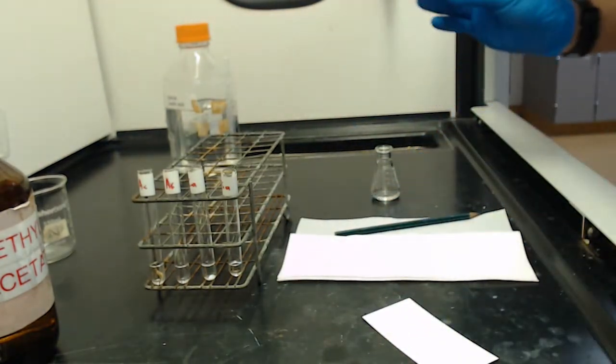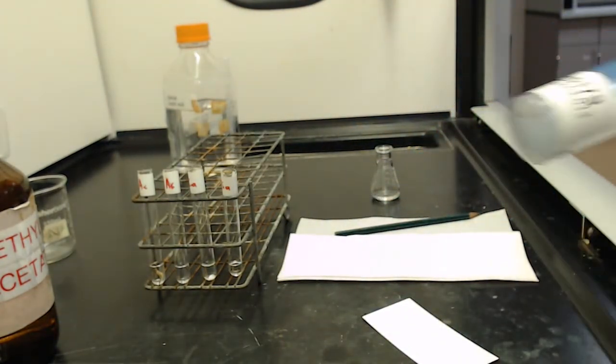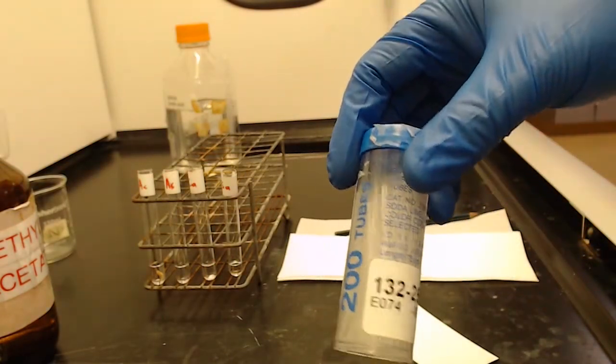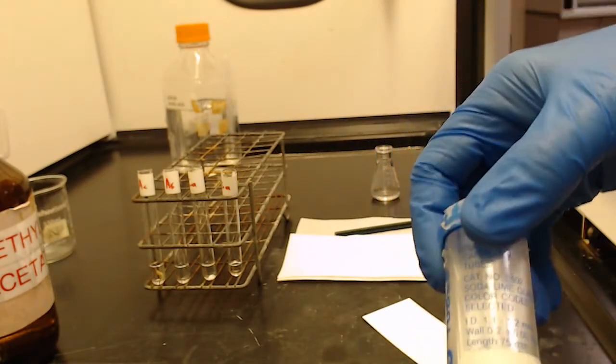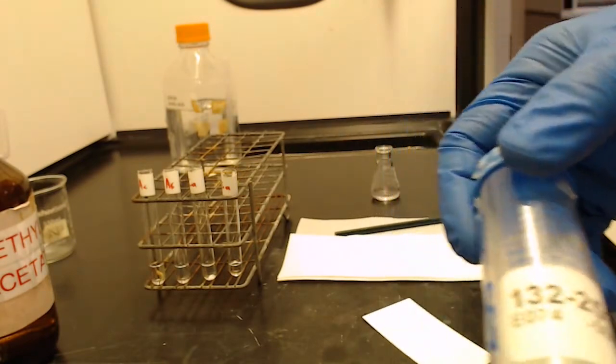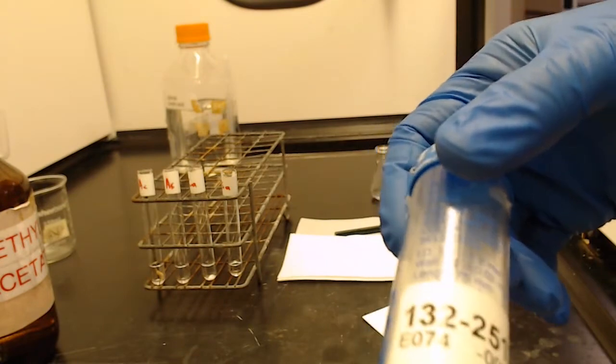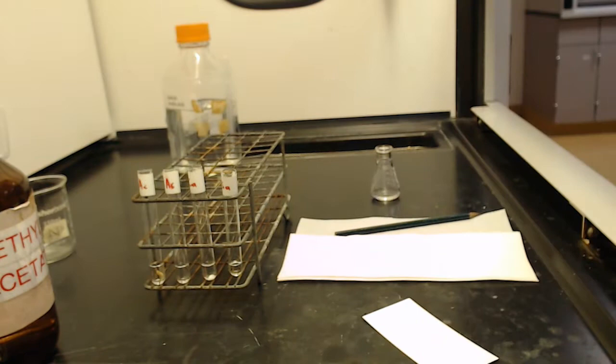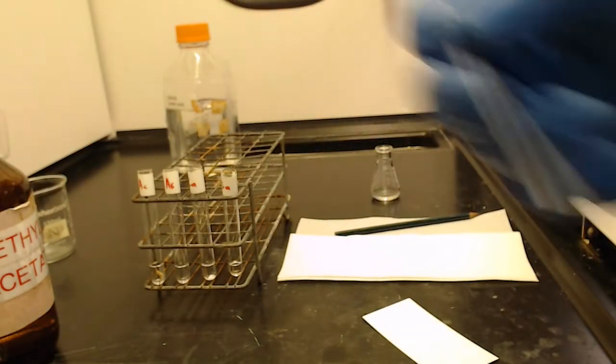Okay. When working with the capillary tube, make sure you have the correct ones. Being an organic lab, chances are you have 2 different types floating around. You'll have your standard capillary tube and you'll have a melting point capillary tube. Remember, the melting point capillary tubes are closed on one end. We want the regular ones that are open on both ends. In this particular lab, as at least all the CSN labs, we order the smaller capillary tubes, so they're easily distinguishable by size. The small ones are the ones that we want. So the small, teeny ones here.